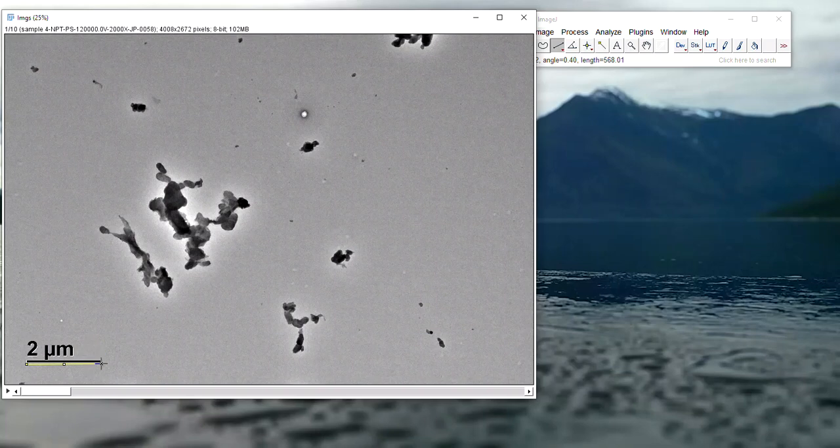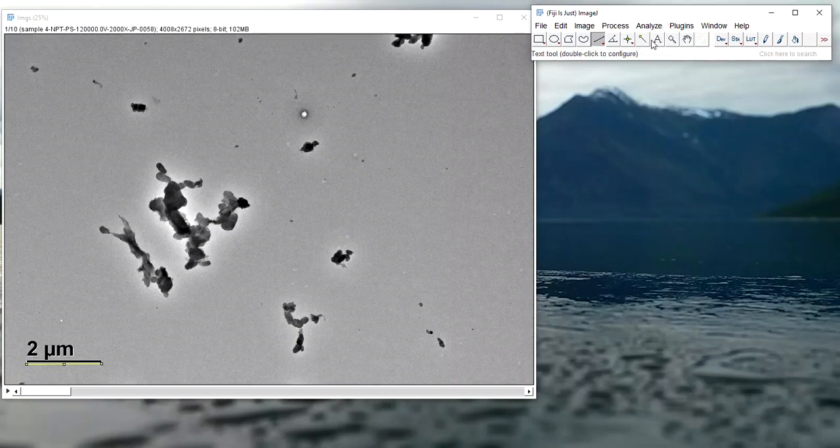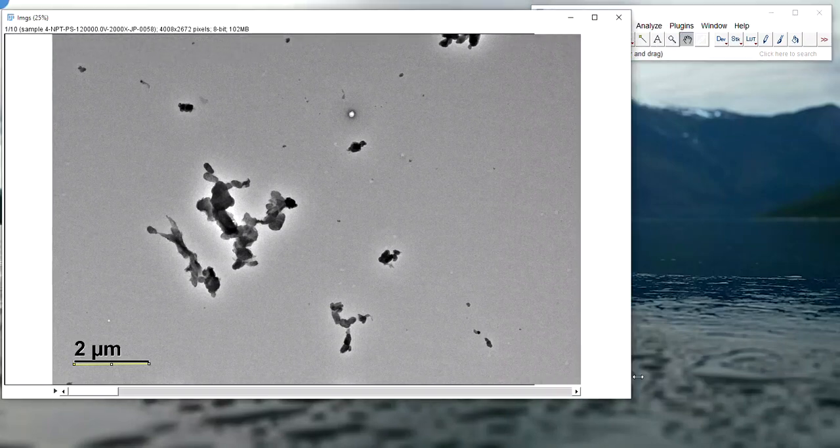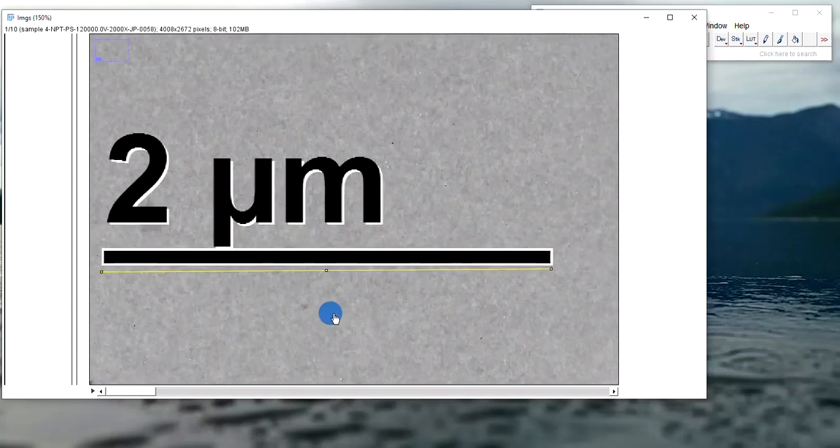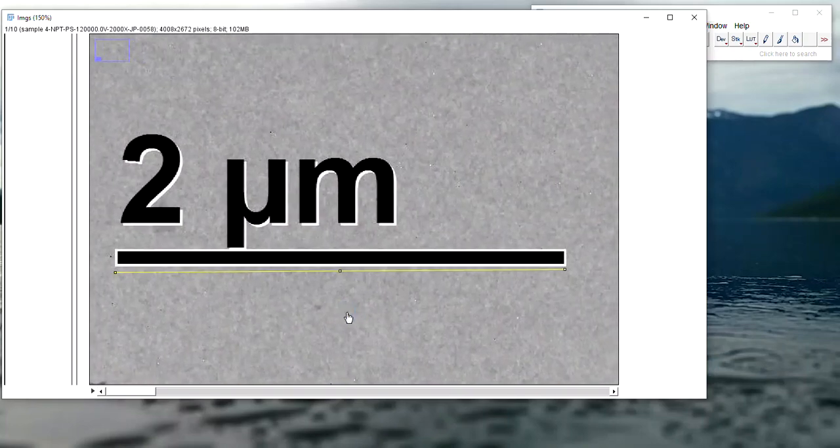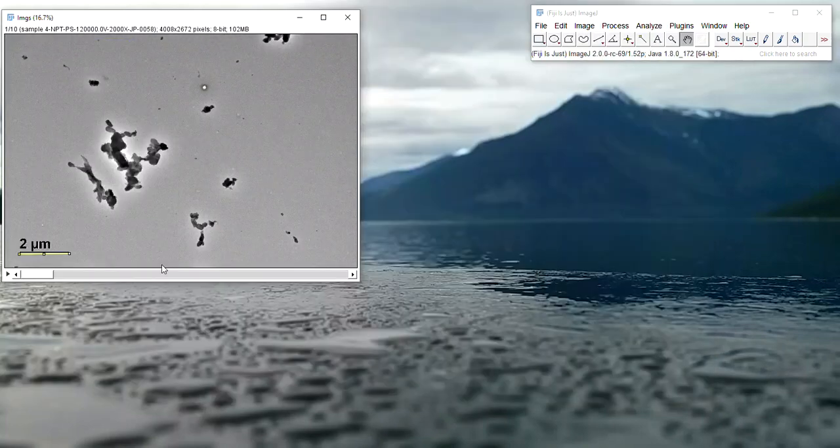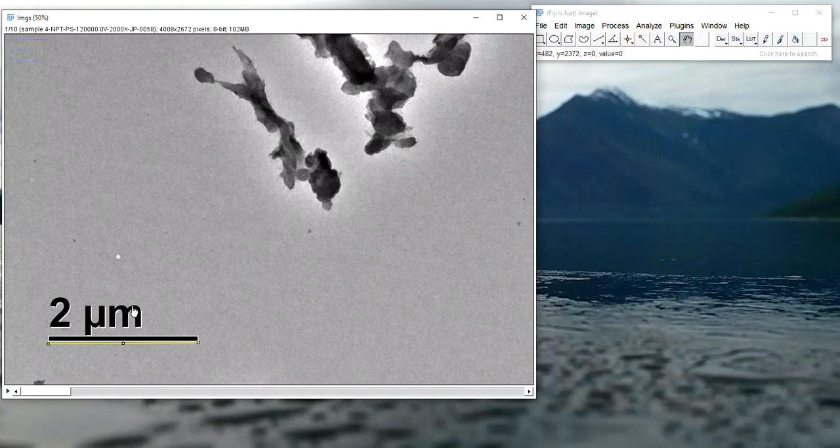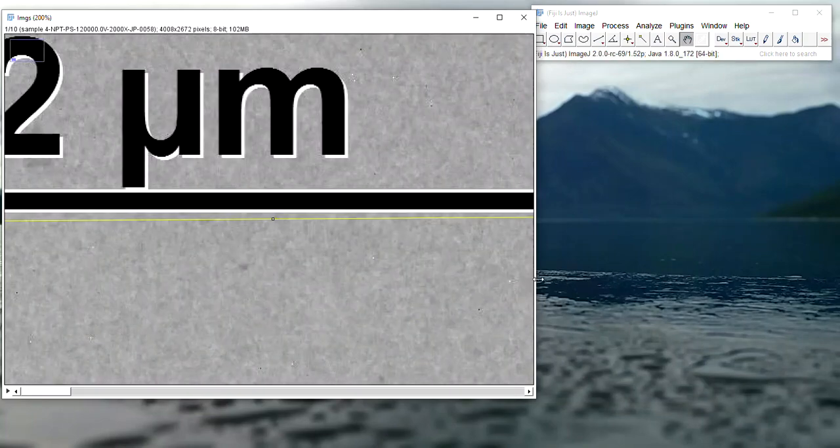So to do that, we're going to tell ImageJ about the magnification of this image.